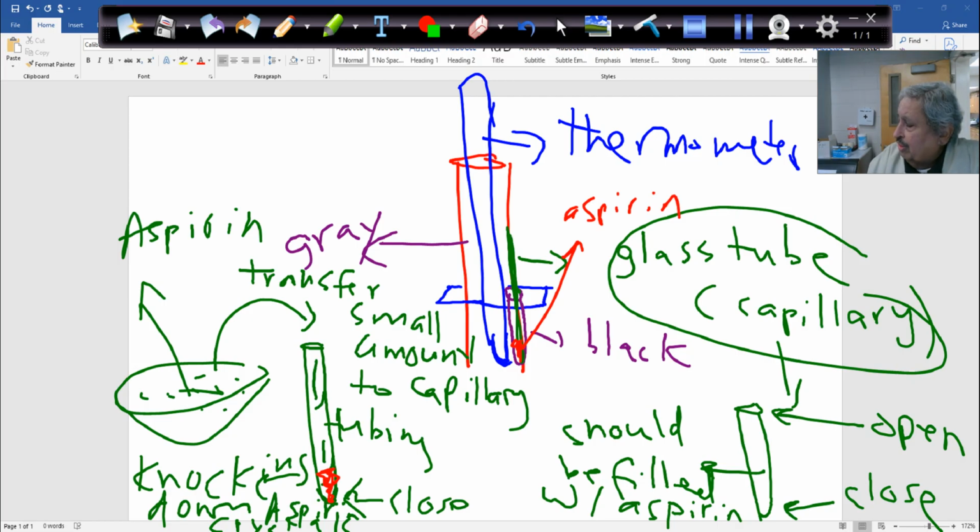We started with 8. That's large because the temperature of aspirin is not that high. So maybe we'll make it not 7, maybe 5 or 4, to see how the whole thing goes. And then we'll keep monitoring here from the big one.